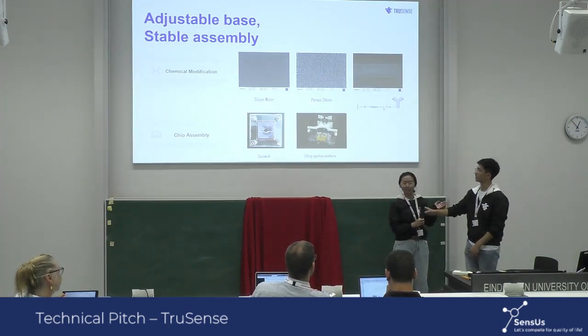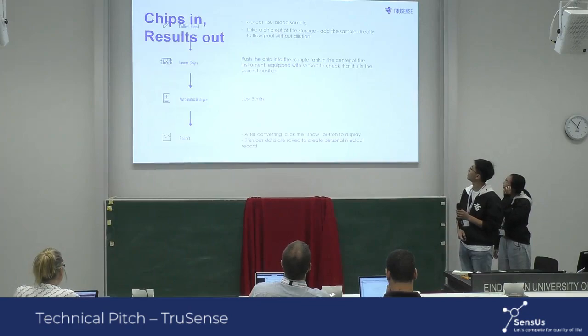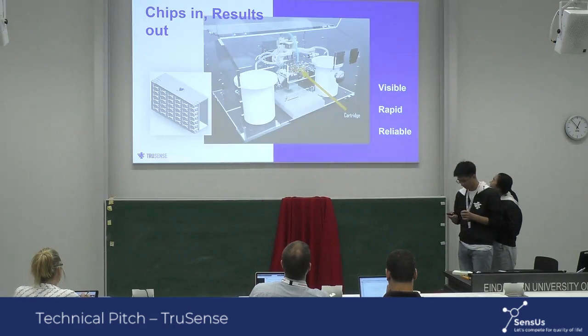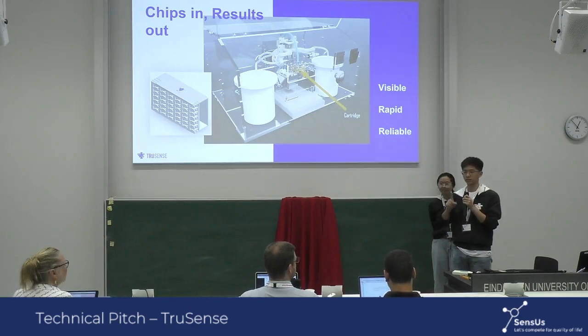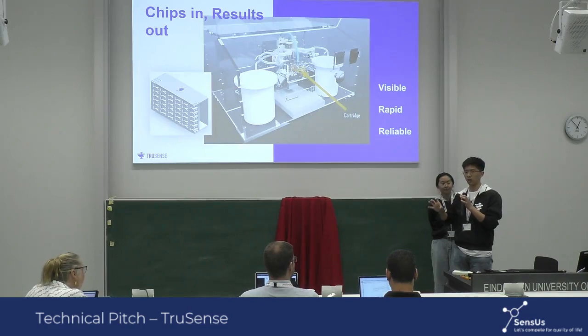Sorry, this is for the chemical. Let me see the proofs. Yes. First, the silicon is kind of waterproof, so we have to make it easy to connect to the water. This is the first step, and we oxidize the silicon wafer. In order to increase the signal, we have to connect the anhydride group to the silicon wafer, and with an amino group on the other side, they will combine.